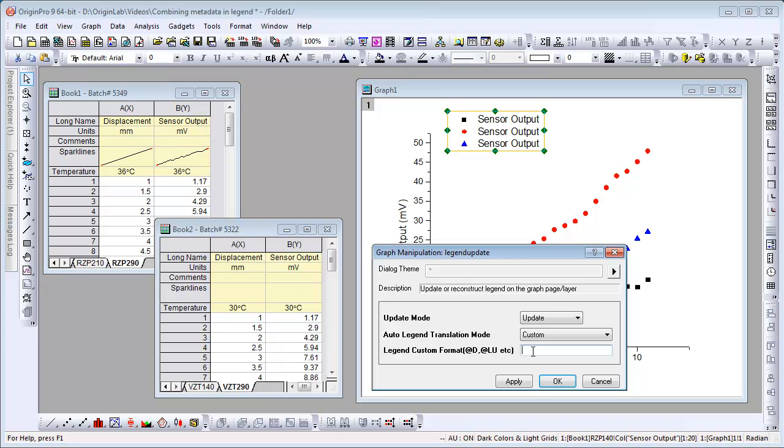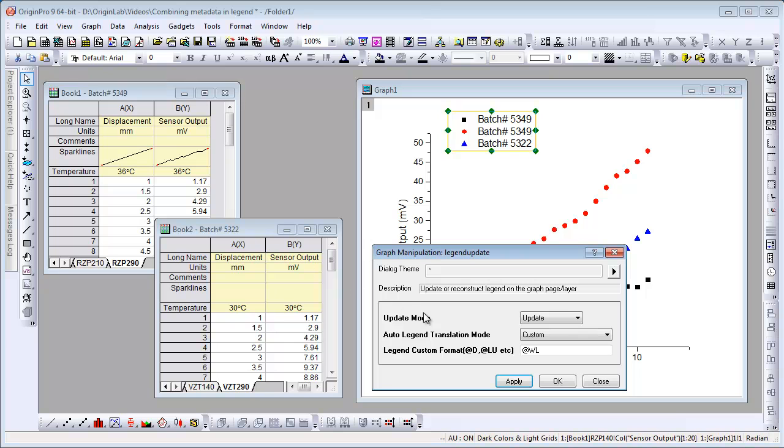Now custom can be a combination of substitution notations such as the workbook long name. We can combine this with some literal text that we'll type in.